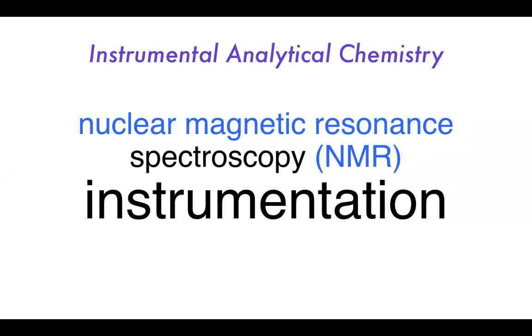Okay, hello, and welcome back to this next session on NMR, nuclear magnetic resonance spectroscopy, where we'll be talking a little bit more about the processes that occur within the instrument whenever we're doing the measurements. We've already established that by introducing some sort of magnetic field to our nucleus, we can get a split in the energy levels that are otherwise degenerate. And then the split in the energy levels obviously creates a certain energy difference between them.